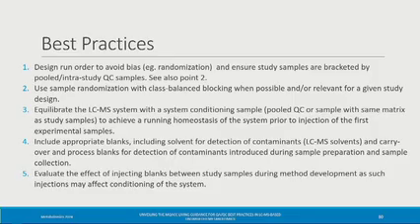Hi, I have a question for when you have very large studies and you have multiple batches. What's your recommendation for the inter and intra QCs and also the dilution PBQCs in your running order? Because of course we want to maximize the number of samples per batch, but we also want to have all the quality control checks within each batch, right?